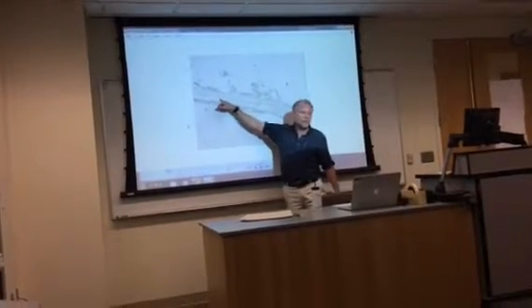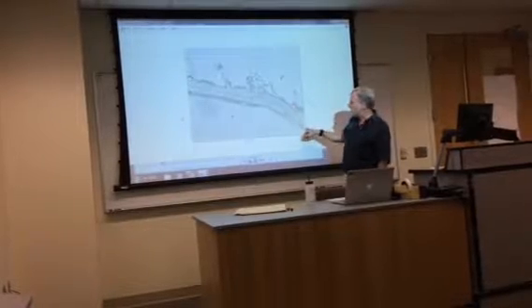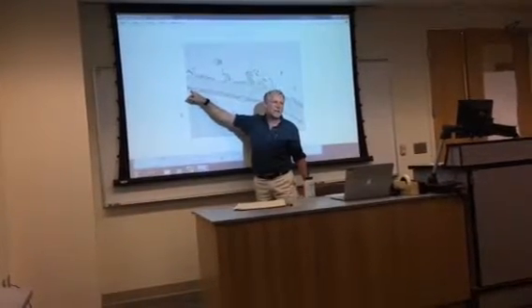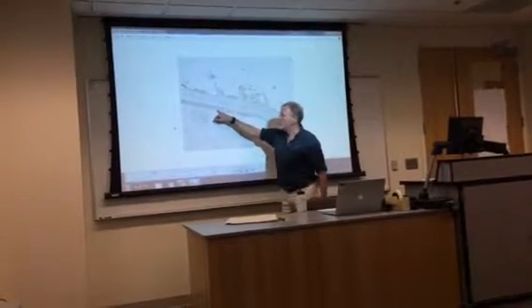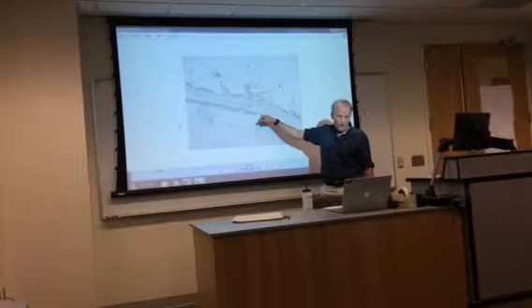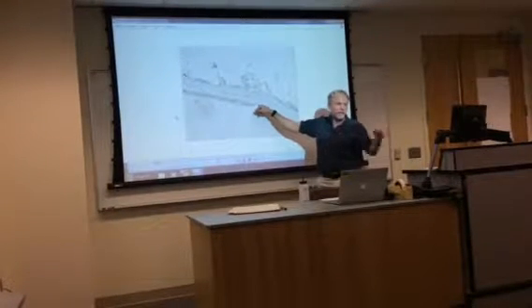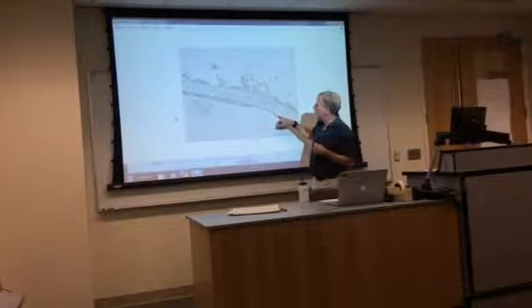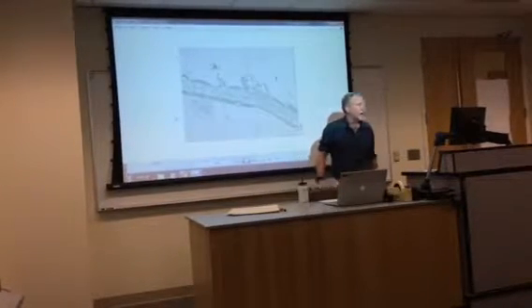Here are parenchyma cells mostly storing water and not photosynthesizing. On the top surface, there are photosynthetic cells. On top of that are cells that have a heavy cuticle, and then there are pores that allow for gas exchange. Make sure you see the Conocephalum in back, because the pores are really obvious on that. Okay, so you have that going on there on the top.